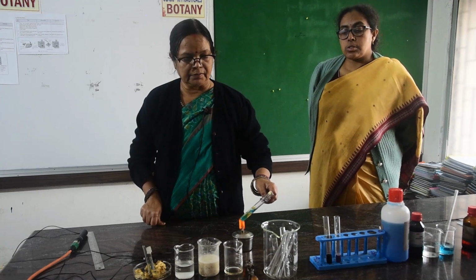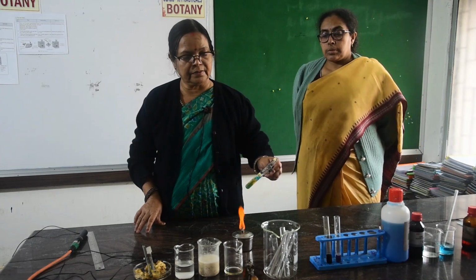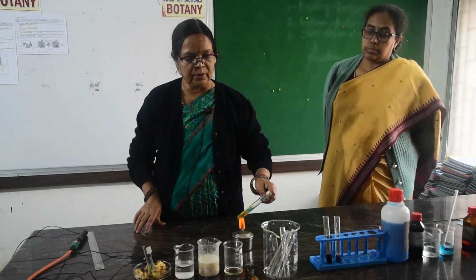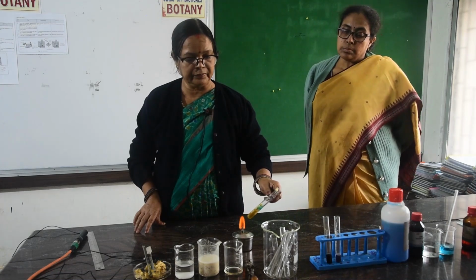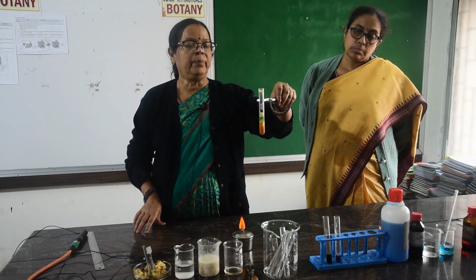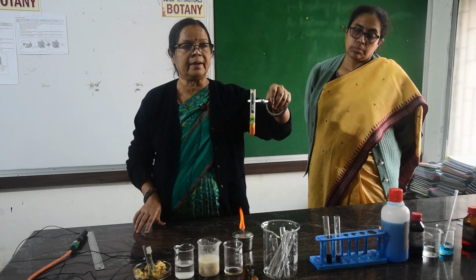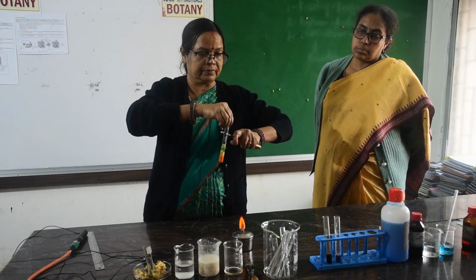These are the precautions you have to take. Now the color turns green and gradually turns to brick red. Look here, the color is changing. Now it has turned to brick red color, which indicates the presence of glucose in banana. So this is the test for glucose.